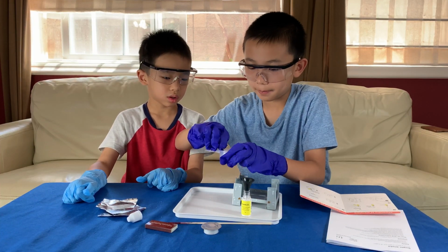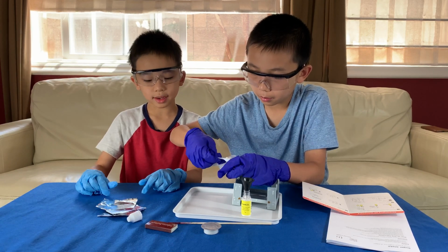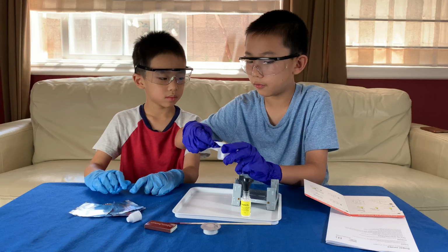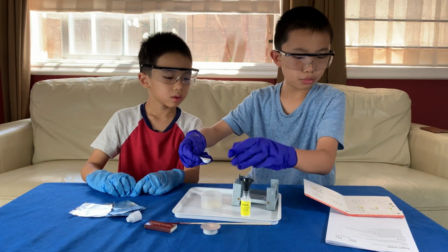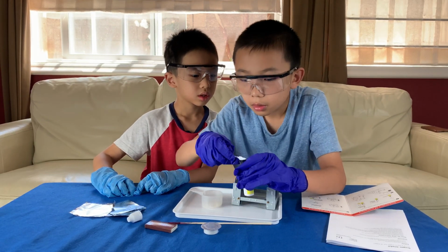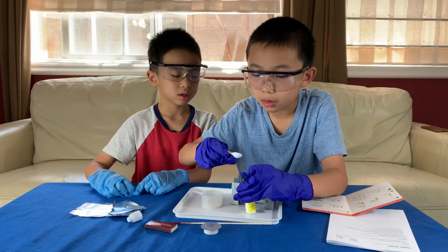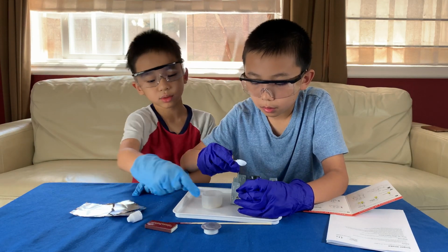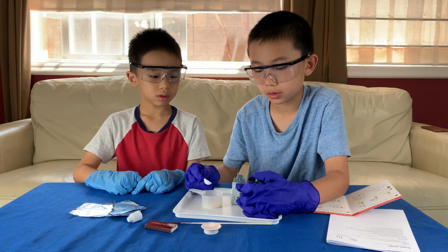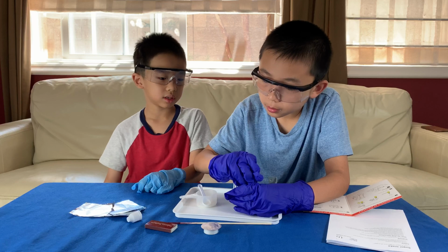Okay, we're gonna try again because this isn't working. Just put a little bit there. Okay, this is the first spoonful of sugar. We need three. A little at a time this time so it can go through. Oh good, that went through. If it doesn't go through this time, let's just use a stick to push it through. It's almost through.